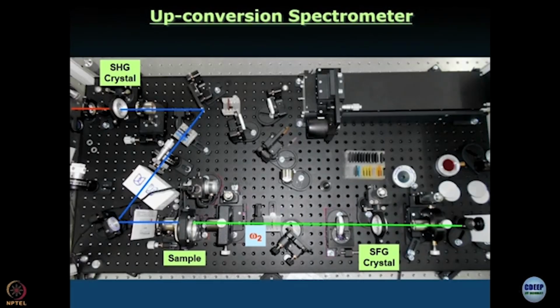Why do we need a nonlinear crystal? What is it doing there? What is the function? How does it help? We will come to that shortly. But for now, we need to remember that this is a sum frequency generation crystal.